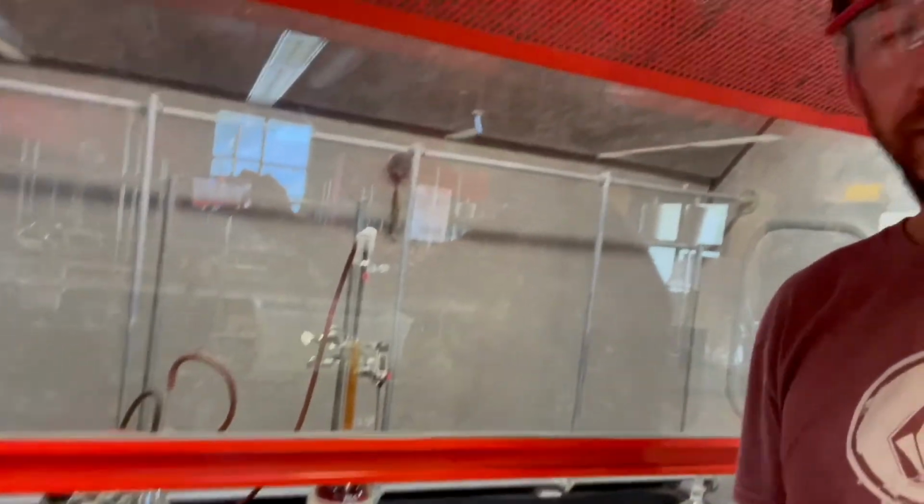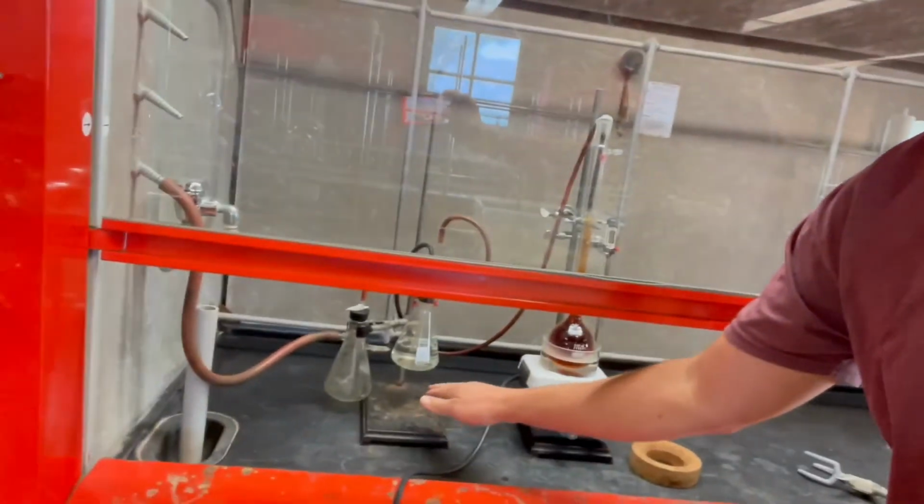So now what we want to do is, there is still a lot of gas forming, but I let that heat for quite a bit. So I'm going to take it off the heat, let it cool a little bit, and give it a little swirl so that the gas that's in there gets sucked up into our trap. Okay, so once that gas is gone, I am going to pour the reaction into cold water.